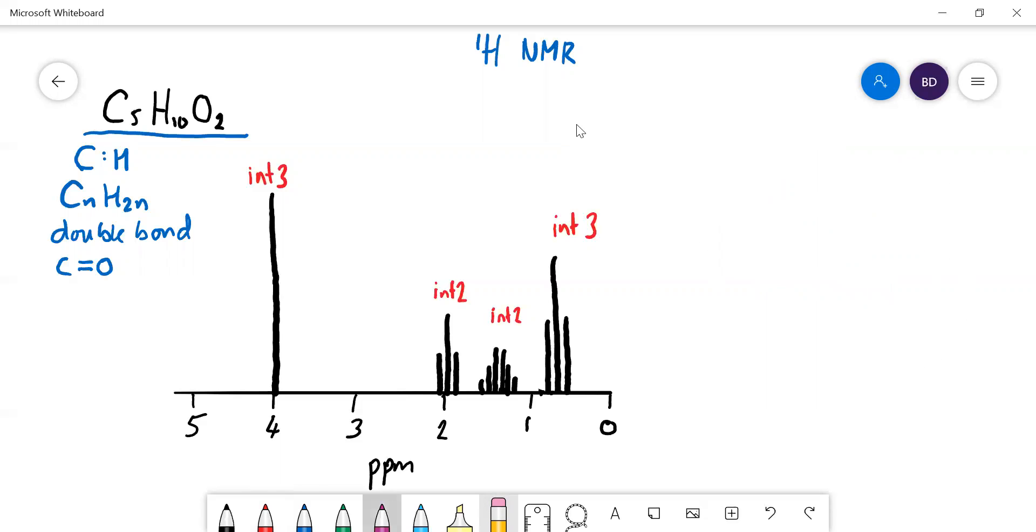Let's have a look at the integrated values. We've got a 3, which is probably a CH3. We've got a 2 here, which is a CH2, another CH2, and another CH3. We're pretty sure about that.